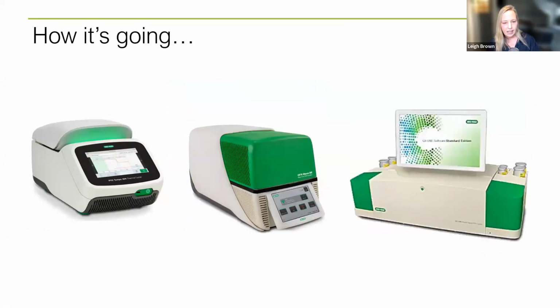And here's where we are today. Obviously, these are Bio-Rad thermal cyclers. On the left, we have a PTC Tempo. That's one of our newest, just endpoint conventional PCR thermal cyclers. In the middle, we have a CFX Opus, and that is a real-time PCR machine. And on the right, we have a digital droplet. This is kind of top of the line.